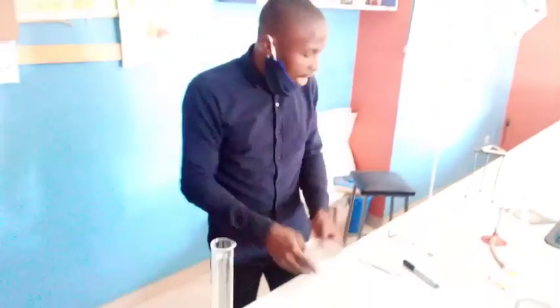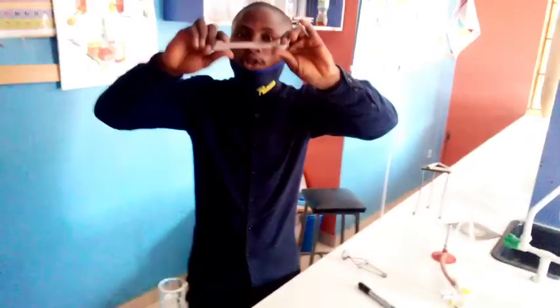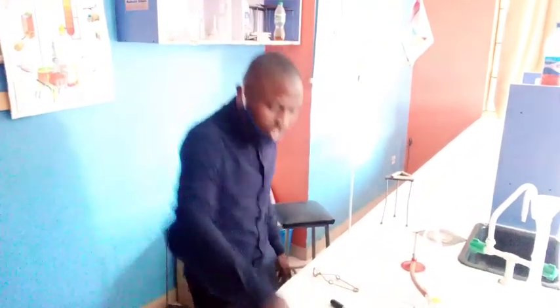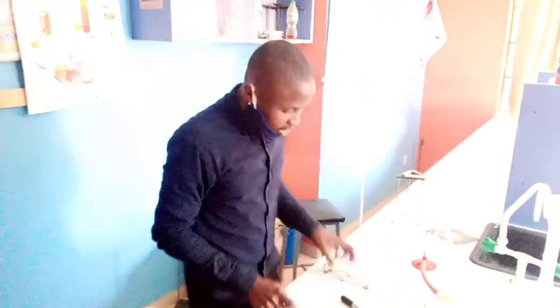All right. Then we have the spatula. This is how it looks, in case you are told to sketch it. It is used for taking small quantities of solid substances. For instance, if you want to take salt, this is what you are going to use on the day of your practical chemistry, whenever you are performing qualitative analysis. So it is used to scoop or take small quantities of solid substances.